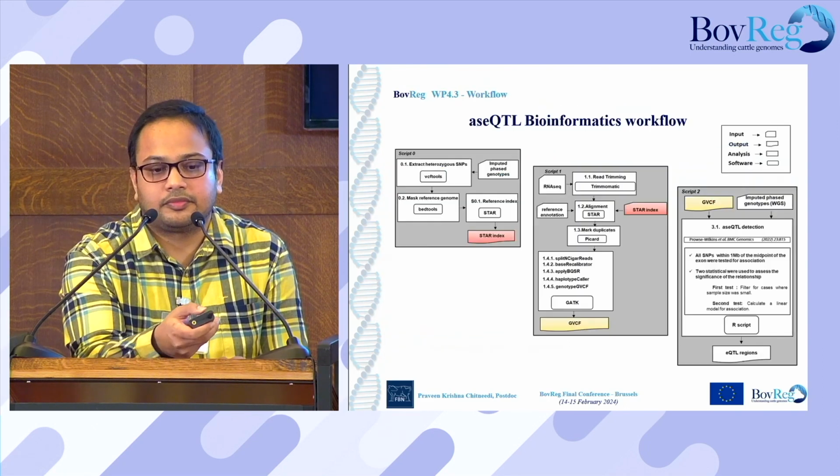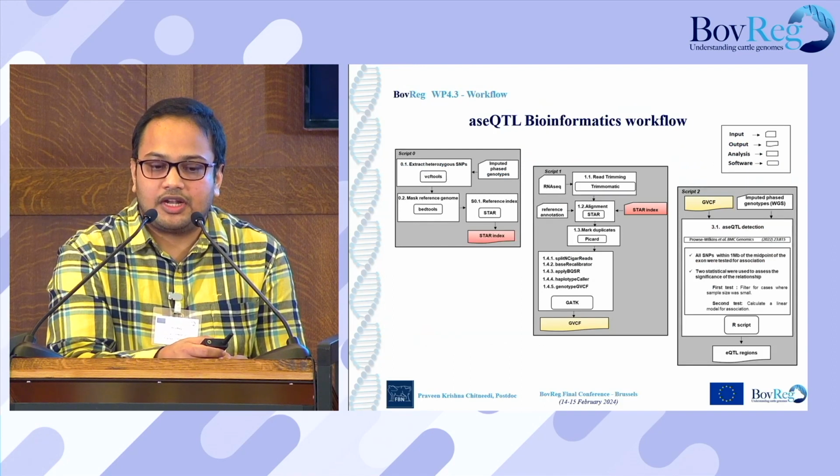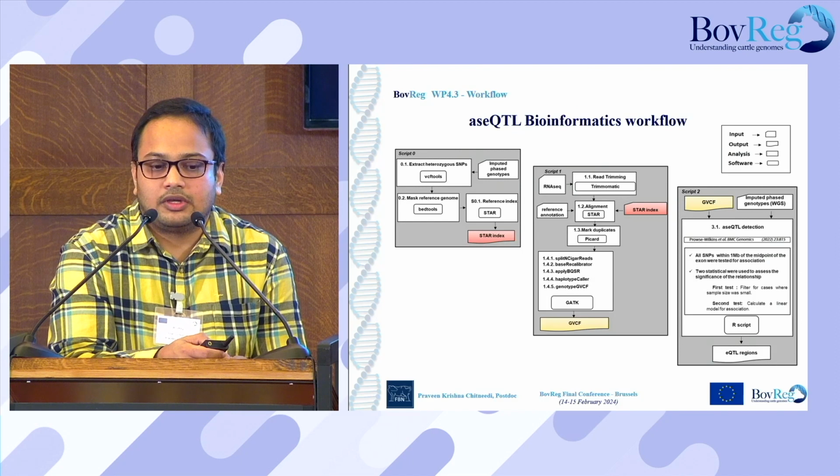Recently we also submitted a paper to NAR Genomics and Bioinformatics explaining this workflow, and it is currently under review. In addition to that, we also performed allele-specific eQTL analysis, for which the workflow is slightly different from the previous workflow. Here we have to mask the reference genome for this analysis, followed by alignment. And then there is a standard GATK workflow to generate GVCF files from the expression data.